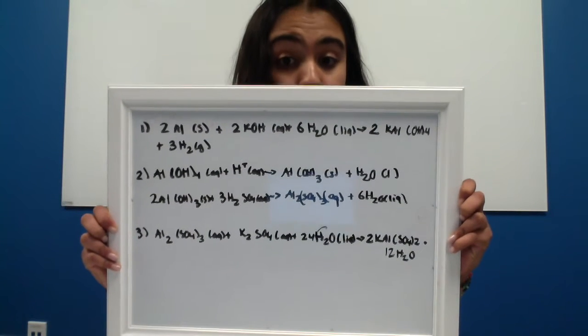After filtration to remove excess impurities with the Buchner technique, the alkaline solution of aluminum hydroxide is clear and colorless. Sulfuric acid is added, which prompts 2 reactions. The first is an acid-base reaction where the H+ ions from the sulfuric acid neutralize the base to create a thick, white gelatinous precipitate of aluminum hydroxide. Al(OH)4- aqueous plus H+ aqueous yields Al(OH)3 solid plus H2O liquid, which is shown by the first part of equation number 2.